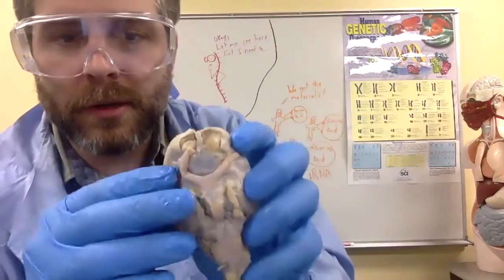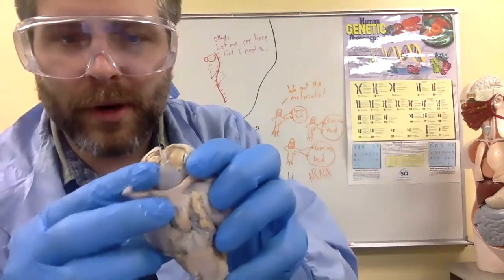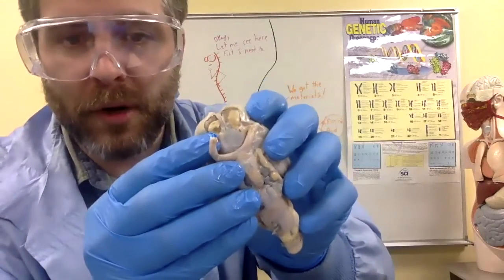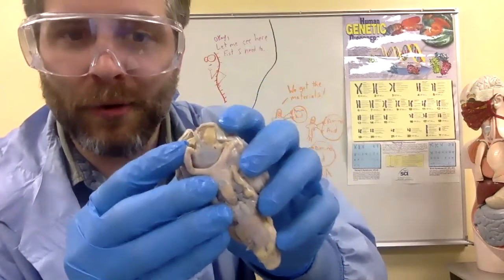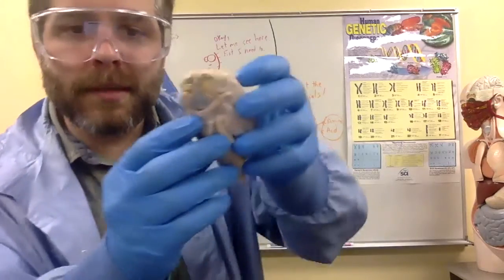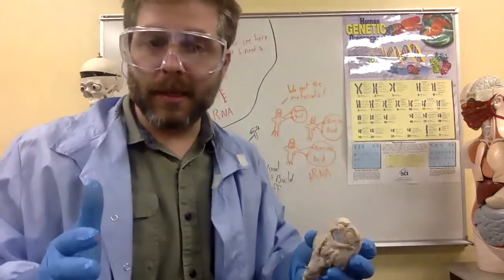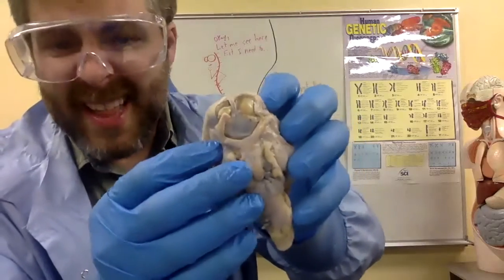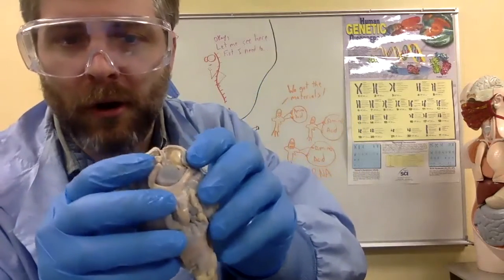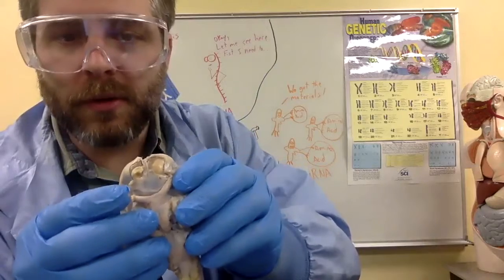Then look closer. Right here, it looks like weird blunted teeth almost in my camera. No, those are even bigger nerves. Those are called the olfactory nerves, right? Up here, for the nose, for a sense of smell. That's what olfactory means. It means smell. So the sheep have much thicker, larger olfactory nerves than they do optic nerves.